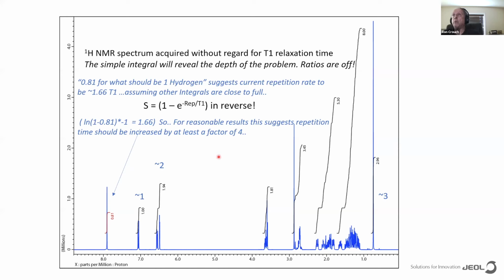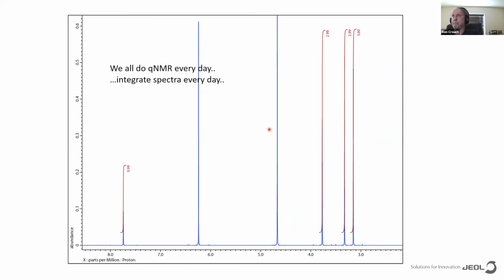So for reasonable results, if we wanted to quantify something using this particular molecule, the repetition time should be increased at least by a factor of 4.